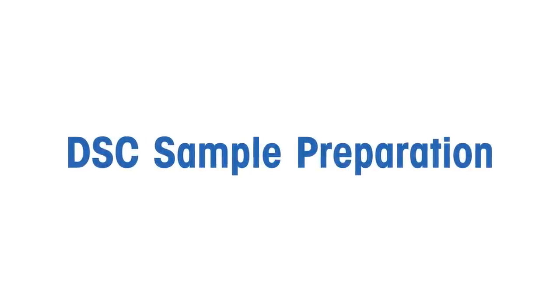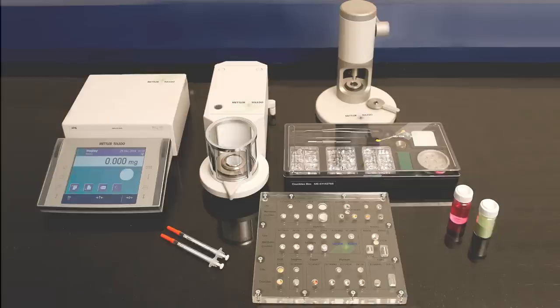DSC Sample Preparation. Mettler Toledo has crucibles for every need. Today we will show DSC sample preparation.